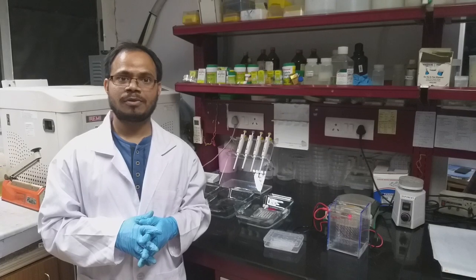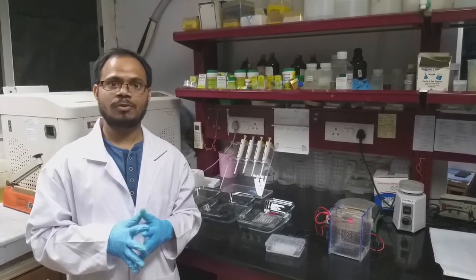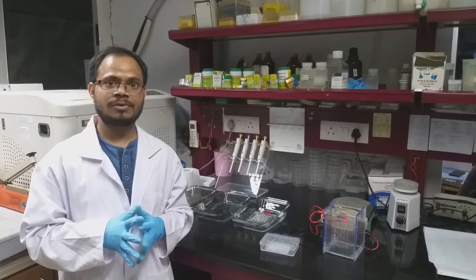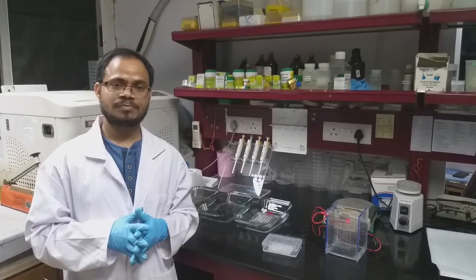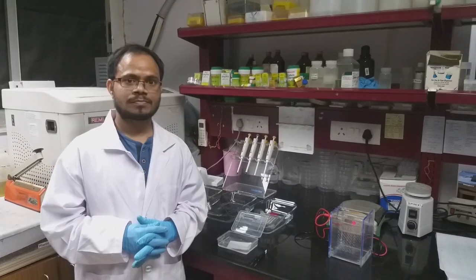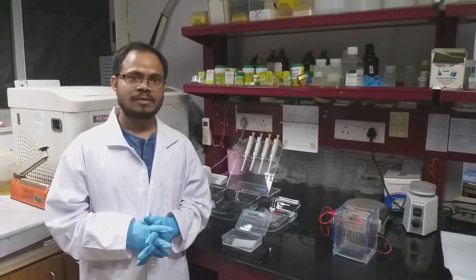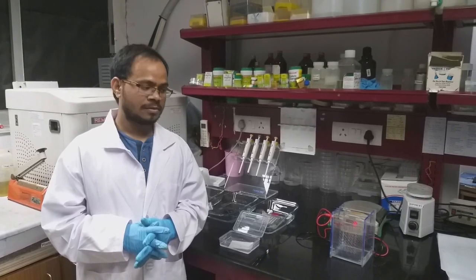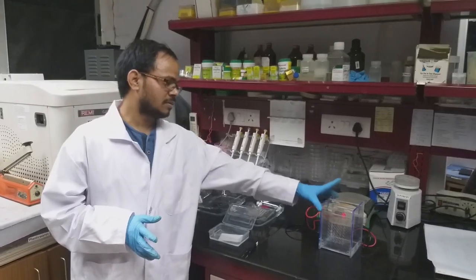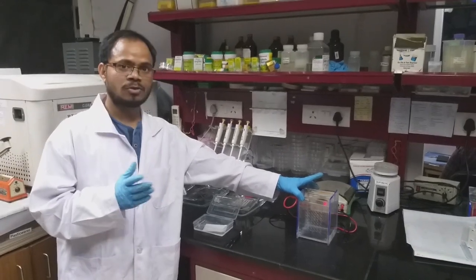In the previous video, we already showed how to prepare an SDS-PAGE gel and how to run protein samples. In this video, we are particularly interested in the factors associated with Western blotting. For doing a Western blot, we need a membrane, transfer buffer, and the transfer medium. This is what we use to transfer the gel to the membrane.